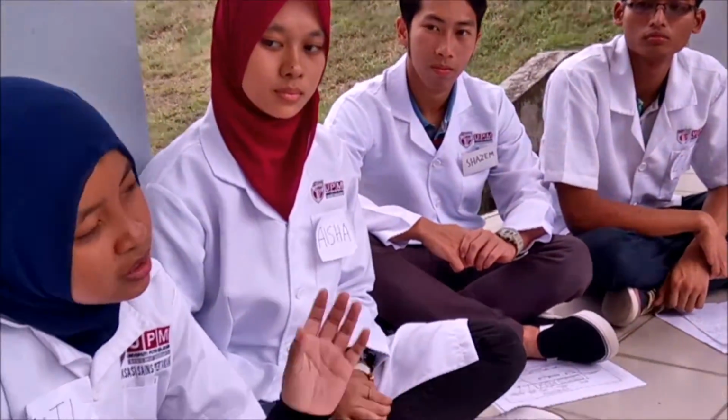Now, we know that the spectrophotometer is a device that must be handled with care. Amira, what are the ways of handling it? Each one of you has explained the complicated things, the principle, the structure, and whatnot about spectrophotometry. So I would like to explain the basic things, the ways, and the guidelines of handling the spectrophotometer itself.